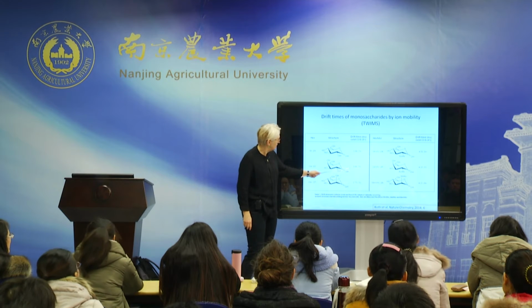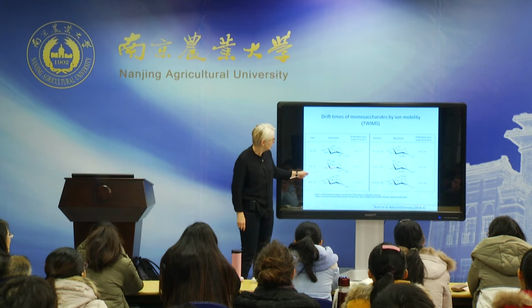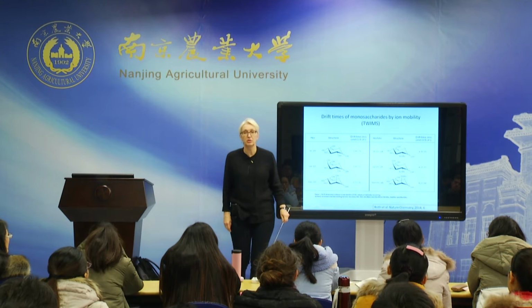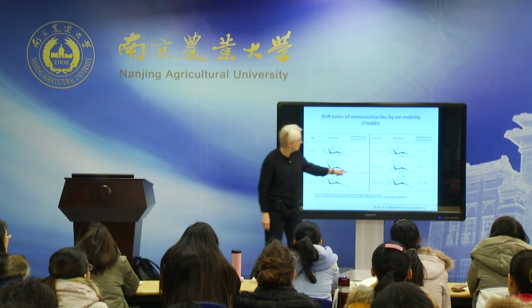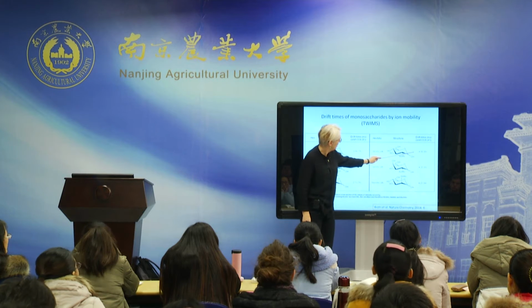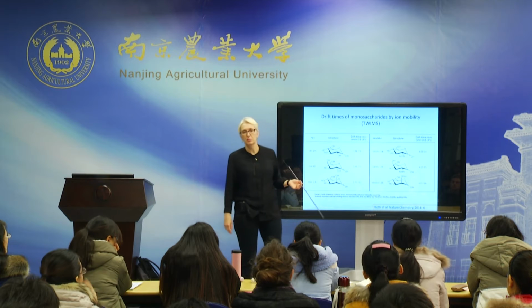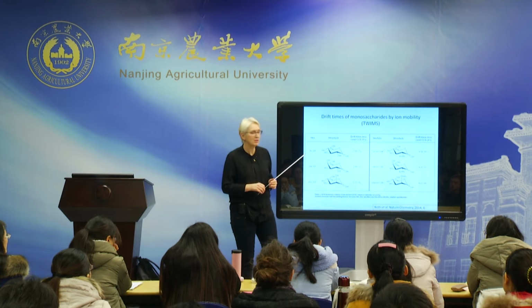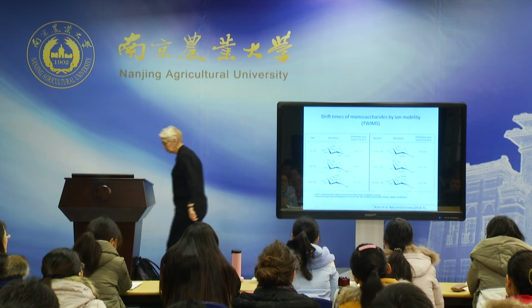Actually, I have to admit, in this particular experiment, the difference between mannose and galactose, so these two up to these two up, is actually not significant. So that's not significant. Those ones in that particular experiment we couldn't separate, but glucose and galactose we could. Okay, and then the NACs, the same thing. Actually, GalNAc and ManNAc in this experiment wasn't very good, but GlcNAc and GalNAc, you can see you can separate. And these were actually the first results we obtained showing that you can separate these things and distinguish between these. And that was extremely promising. We published that in Nature Chemistry in 2014.